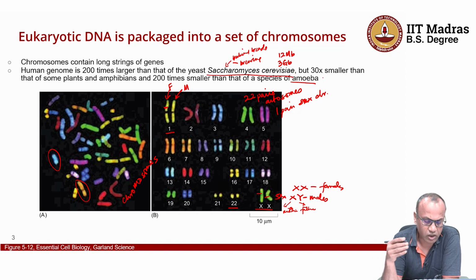Generally, though, as organism complexity increases, genome size also increases, and therefore each organism would require different time frames to sequence the whole genome, and we'll come to that in a bit.